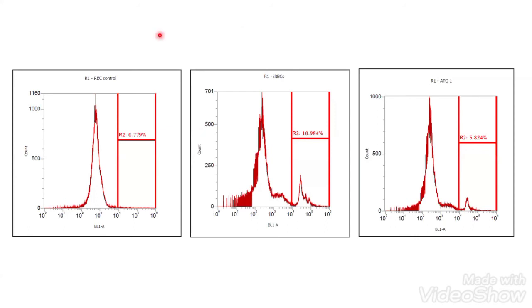Right. To characterize the mixture is a little bit tricky because you need pre-information about which kind of bacteria can be there. How many organisms at a time can we test with the flow cytometer?